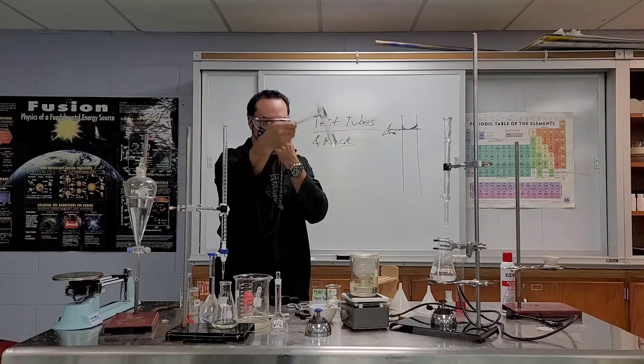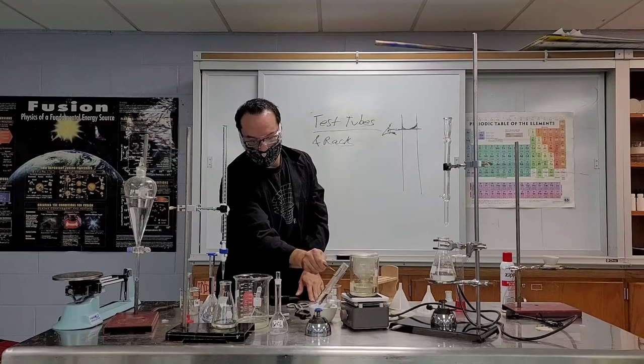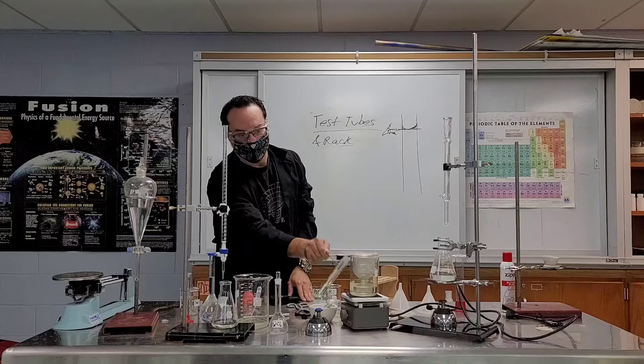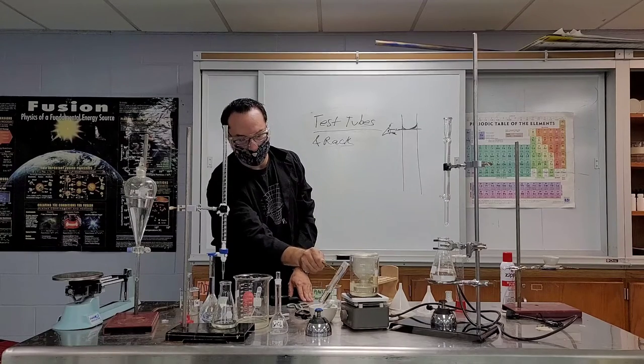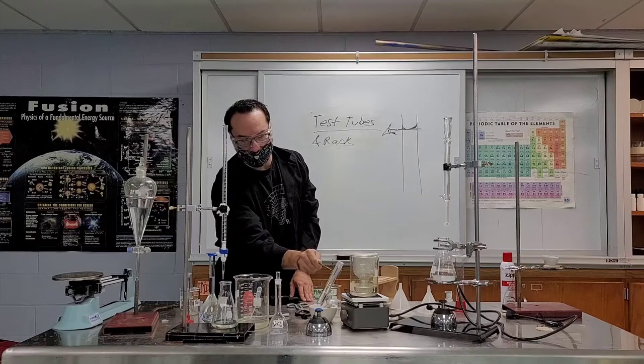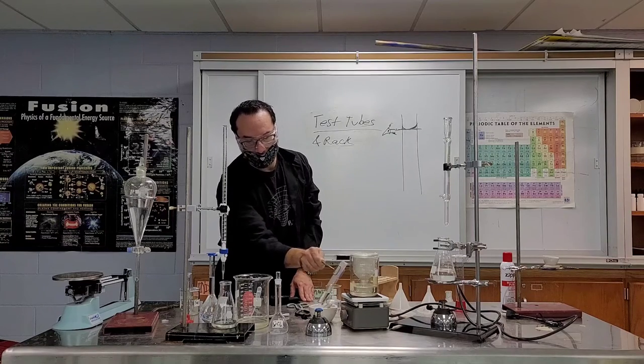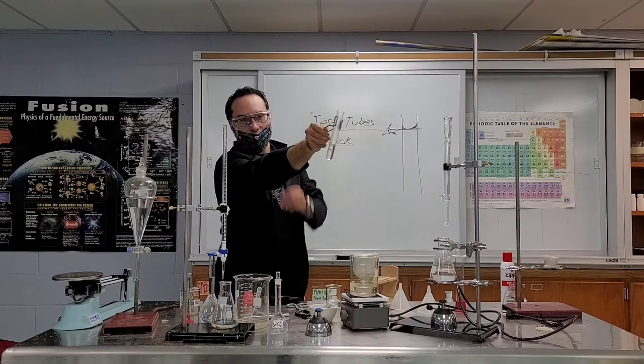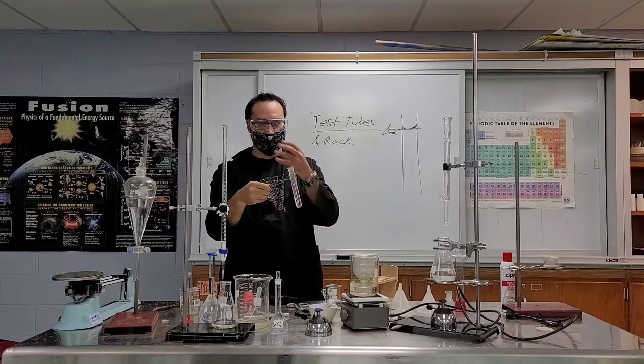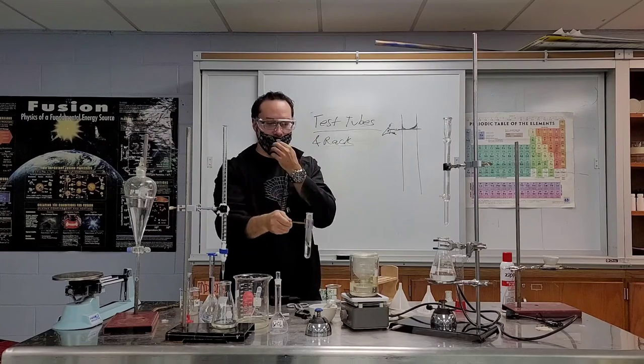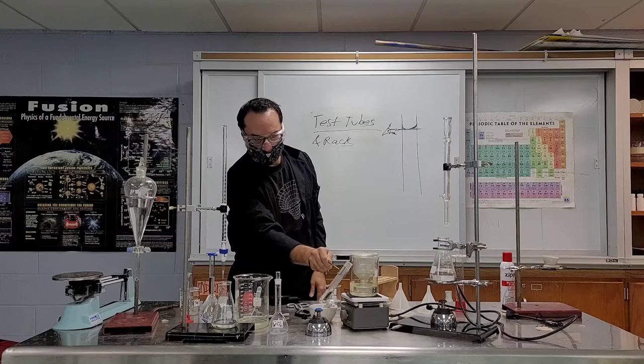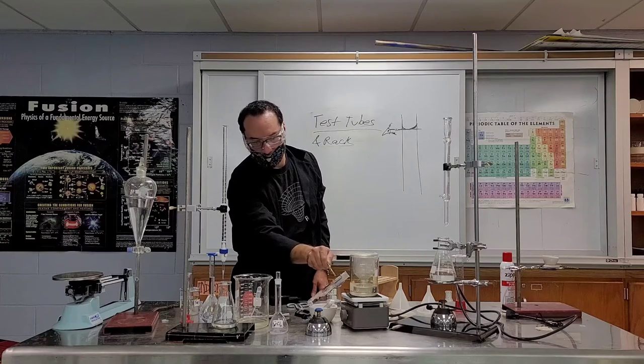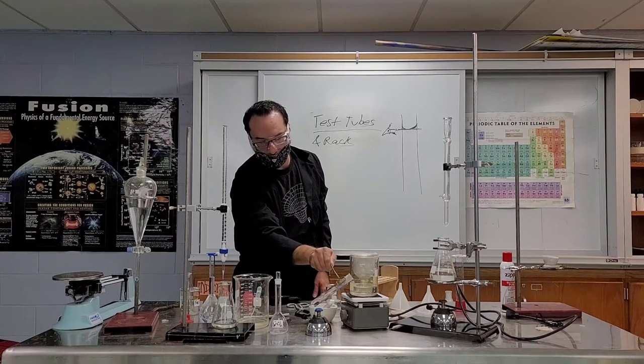By the way, you notice how I'm using the test tube tongs, so this flame is super hot. Oops. You hear that? See, already getting some boiling. So what you do is you kind of gently move the test tube around like that. Don't just sit there with it in one spot. See, things boil very quickly in there, and if you have this pointed at your face, stuff can fly out and burn the crap out of you. So you always go like this, move it around, point it away from you, move it around, keep it pointed away from your face.